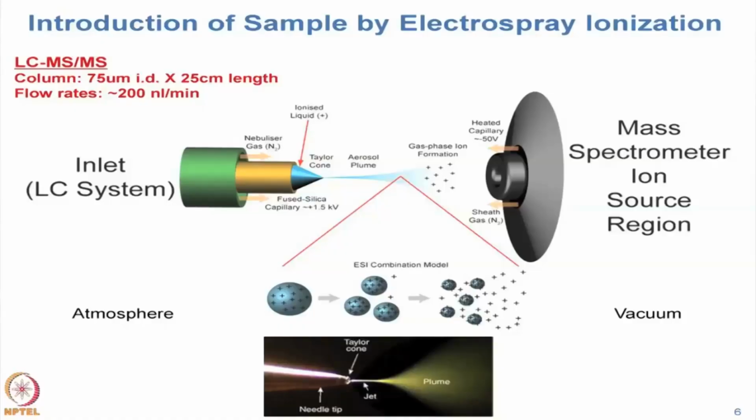The instruments basically generate two types of spectra, an MS spectrum or an MSMS. The MS spectrum measures the complete mass of a peptide, and an MSMS spectrum is after there's fragmentation, and you measure the masses of the fragments that are produced from that peptide.